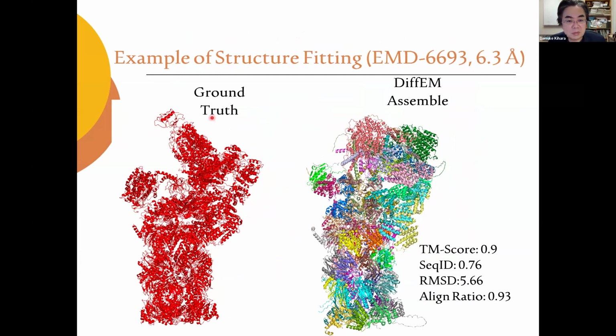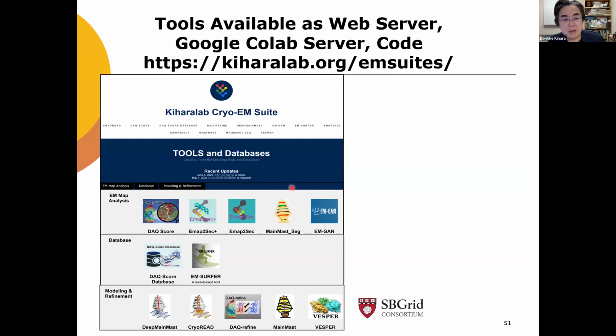Although there are some structures which are not correctly placed, most of the subunits are correctly placed in this map. All right, that's all. So I introduced several methods, and all these methods are available at our lab website.